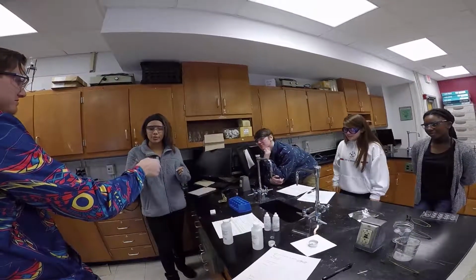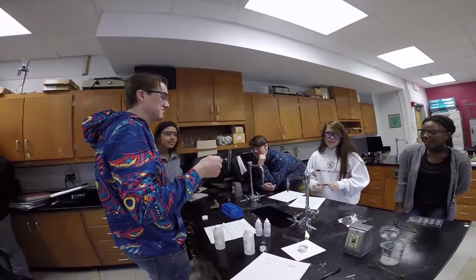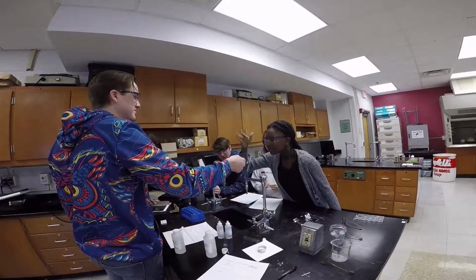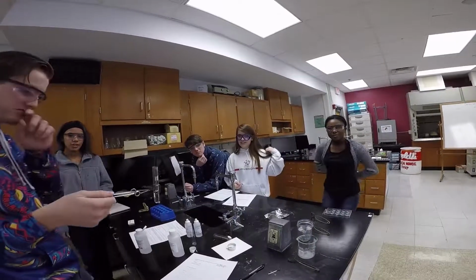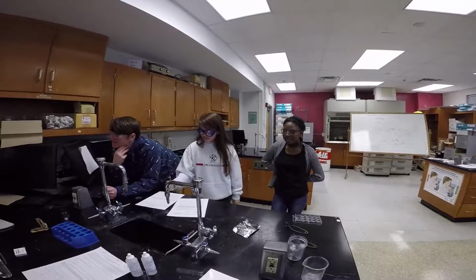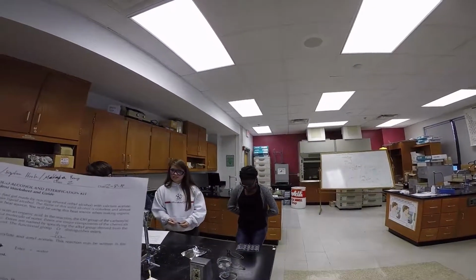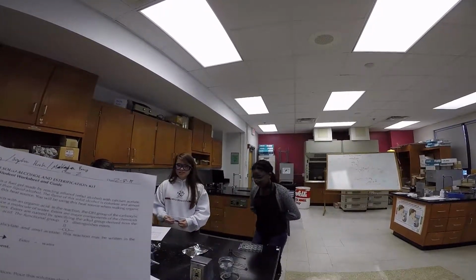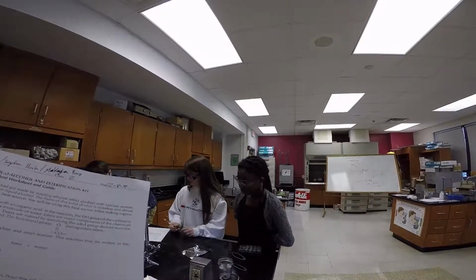I thought you weren't supposed to smell it straight in. You're supposed to wave it toward you. He just went, oh god, it smells like vinegar. It smells like vinegar, but kind of sweet at the same time. I don't know. How did it burn? It just went straight up my nose. It smells worse than something. So it's the color of it. Have you ever tried drinking vinegar? It's absolutely terrible.